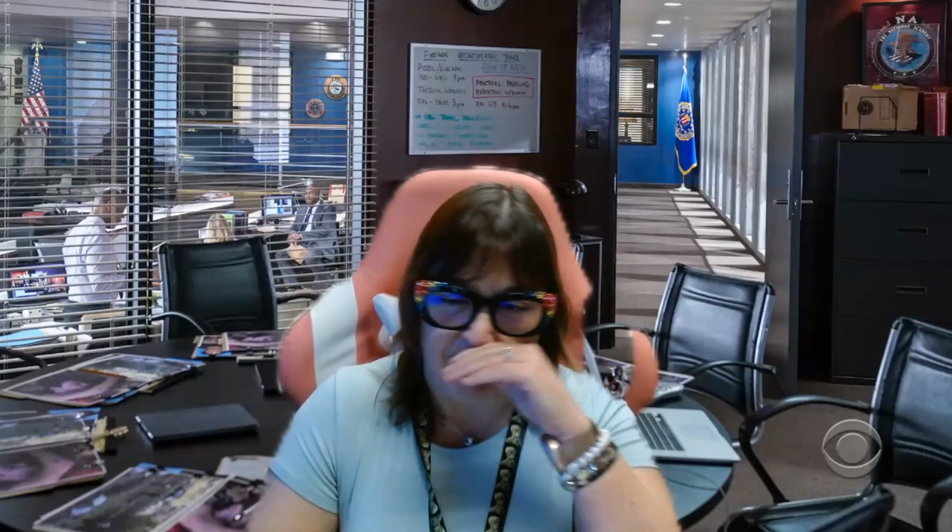So while I understand that you're going to go through the stoichiometry calculations through that experiment, with what you're doing in the virtual lab, things are a little bit different in the way that we set it up in the physical lab. So I wanted to talk a little bit about those differences. And then I want to talk about that stoichiometry worksheet that you've been given.